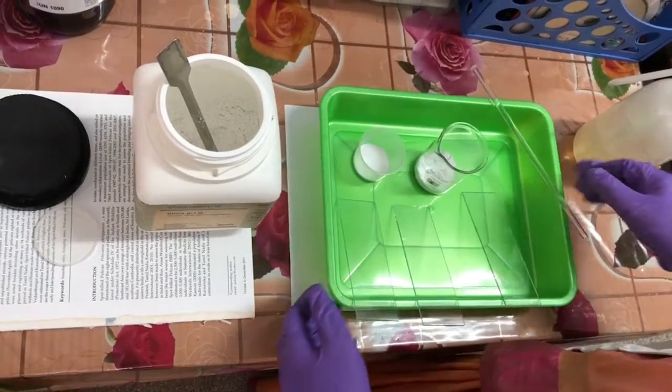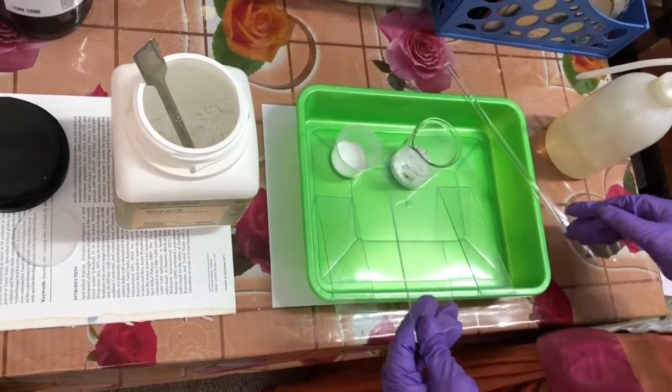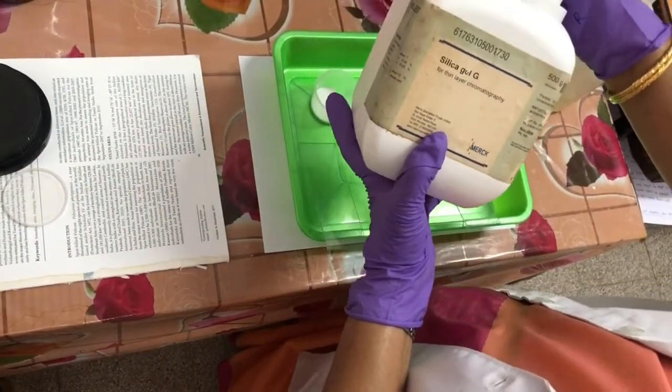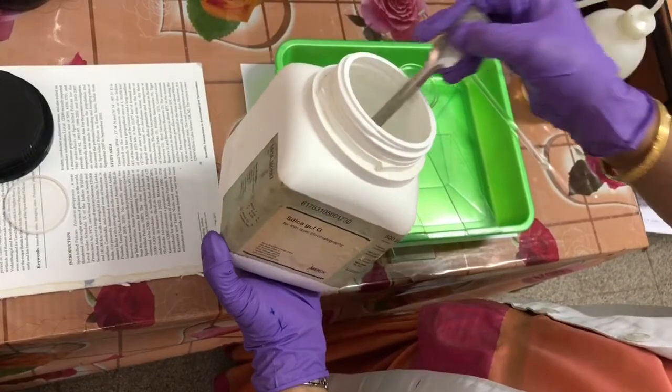This is a simple setup for thin layer chromatography. We need a glass plate and an adsorbent, which is silica gel G — G for gypsum. It comes as a powder, and I have taken two spatulas of this in a beaker.